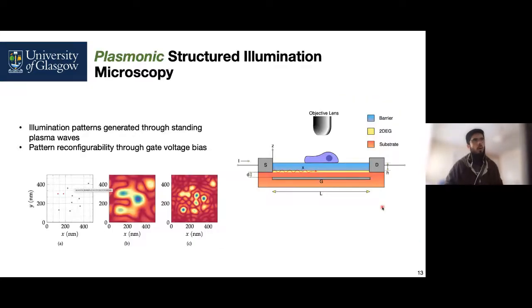So now, moving on, the structured illumination microscopic technique was primarily proposed to work in the optical frequency domain. But with the advancements in the field of plasmonics, particularly in the last 15 years, we saw more and more plasmonic devices being used with which we can illuminate the structure. Some other interesting applications were also proposed in the terahertz frequency domain.